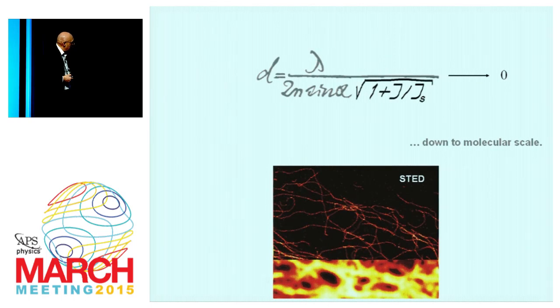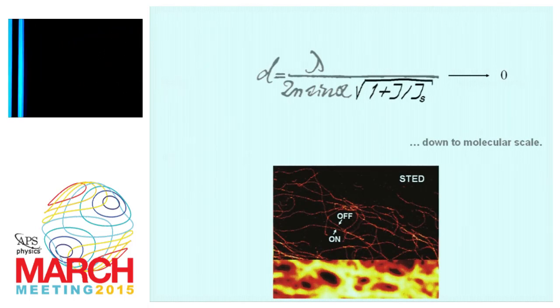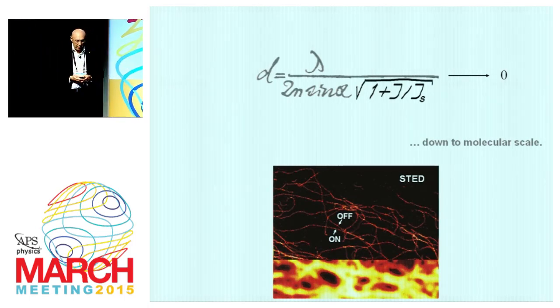And if you ask me now, why can we separate this fiber from that fiber, but there's no way of doing that here? Well, it's very simple. At the time those molecules were in the on state, the molecules of that fiber were in the off state, and vice versa. So in essence, it's a very, very simple solution to a long-standing problem. Thank you very much.